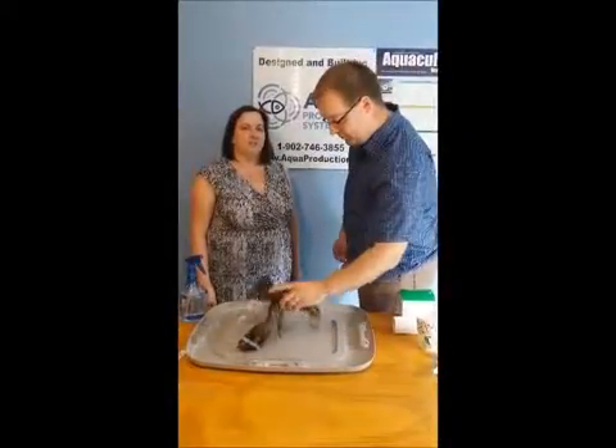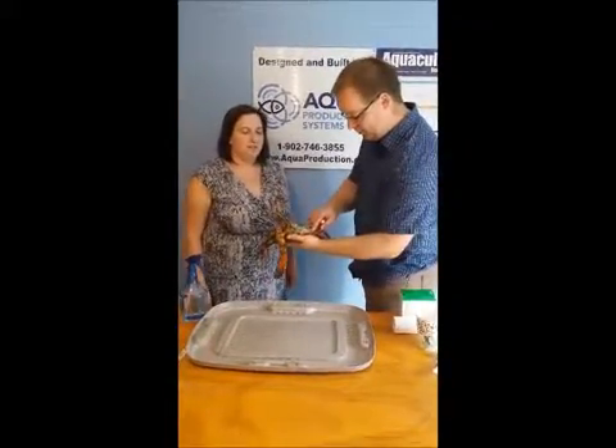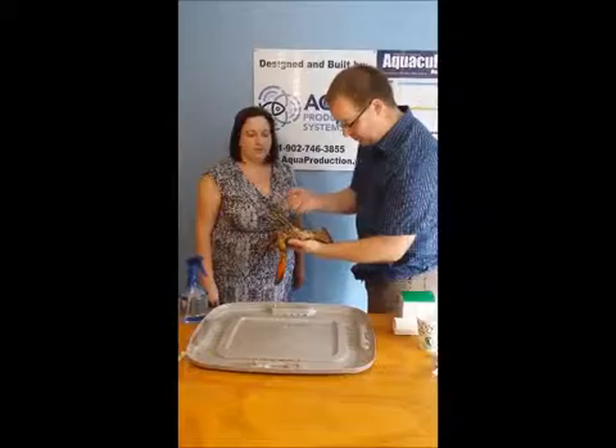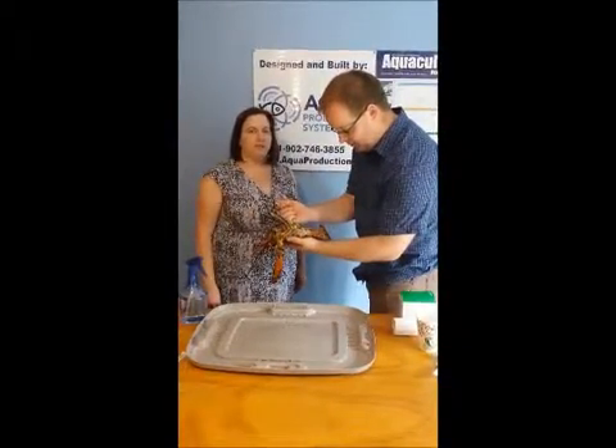Philip is going to turn the lobster upside down, inject the needle into the soft part of the tissue in the abdomen, and extract a quarter to half a milliliter.